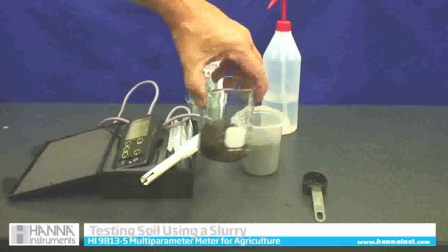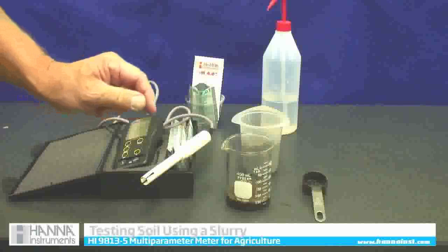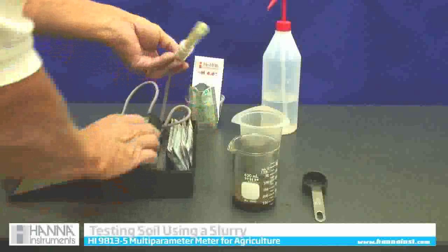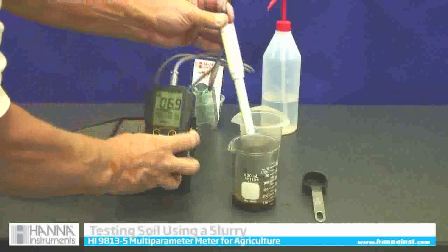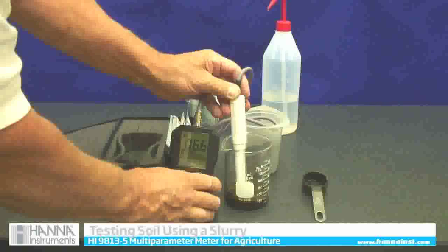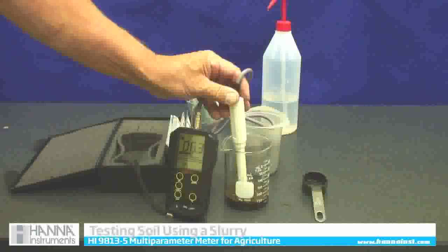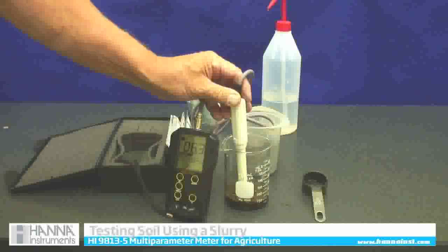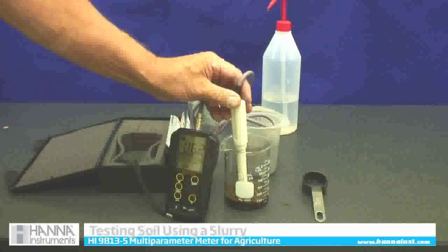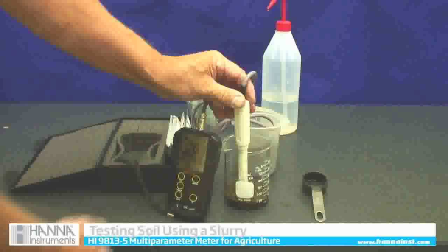I'm going to swirl it around, and normally I should wait 15 minutes before testing it, but for this video we'll go ahead now — all we need to do is place our meter into the soil and we can read the pH. You can see we're reading about 6.3; it's fresh soil so it will probably take a few minutes to stabilize. But after 15 minutes the reading will be stable.